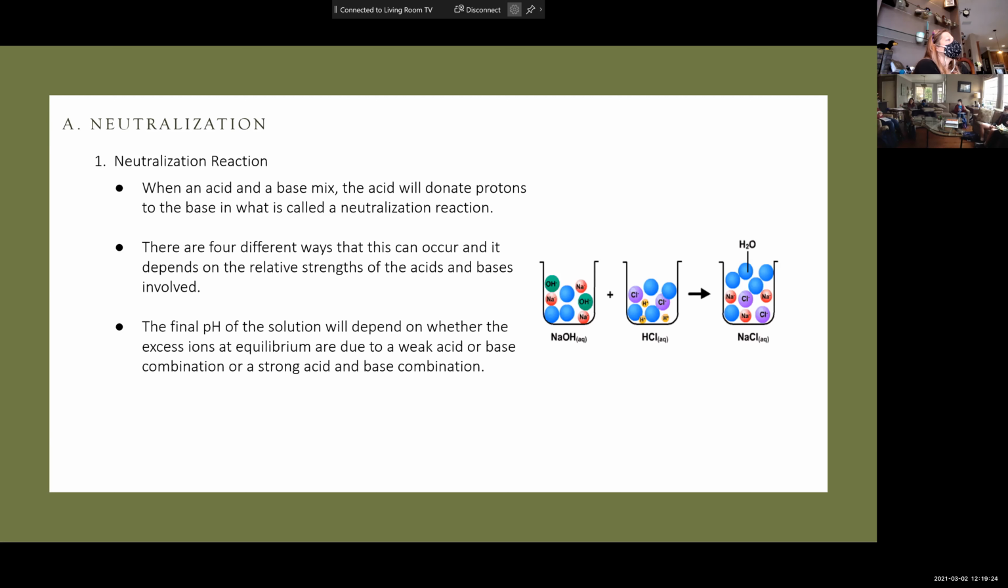If you have an equally weak acid and an equally weak base, and you mix 3 parts acid and 1 part base, it's still going to be more acidic. It'll neutralize, meaning the acids and the bases will cancel each other out. But if you have excess acid or excess base, it's not just strength involved, but volumes too. As you saw today, you were adding and adding and adding, and it took forever to get to a point where you hit neutral.